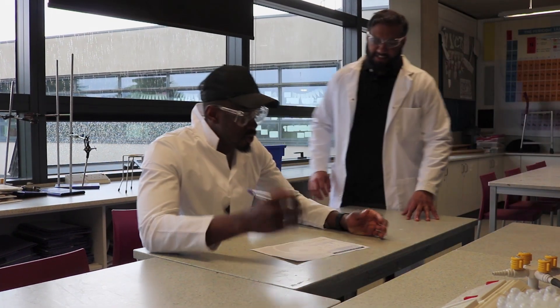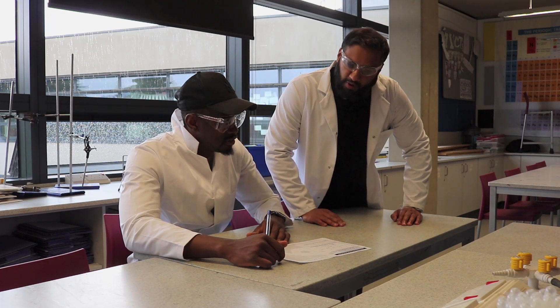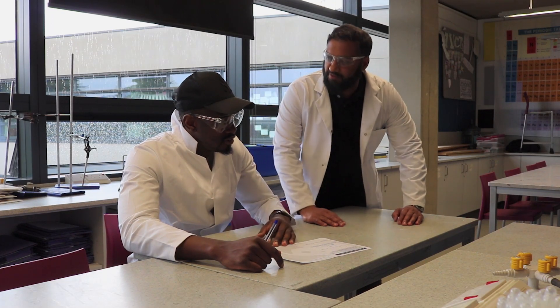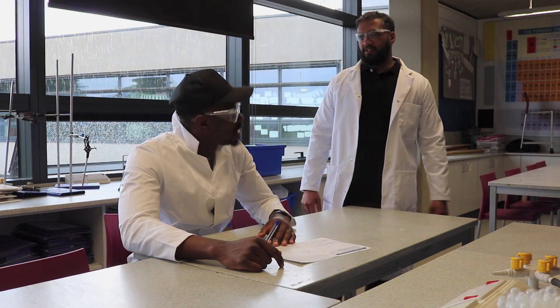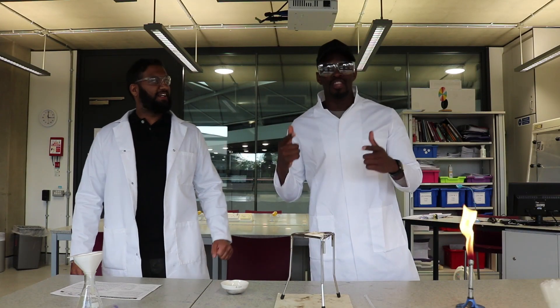I'm Zane and I'm Team, and today we're making salts. This is an AQA required practical — making salts — and we haven't done this before, so let's get started.